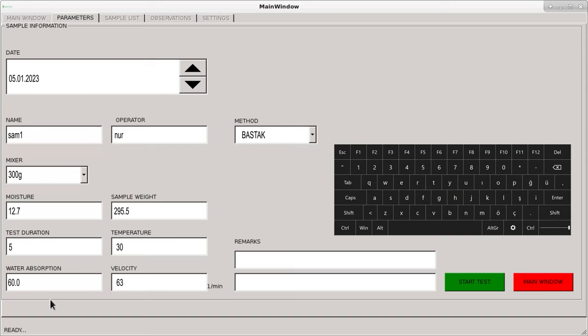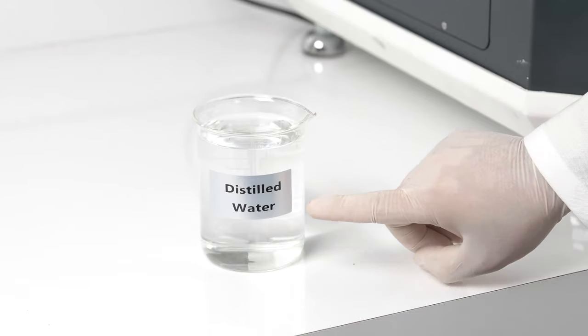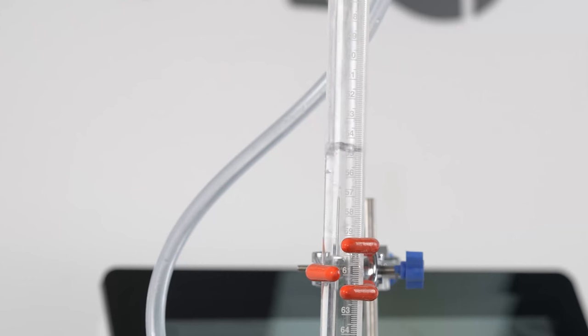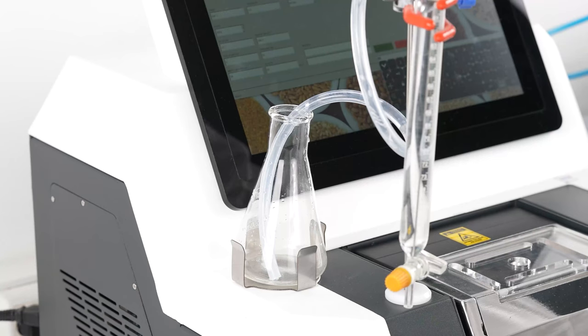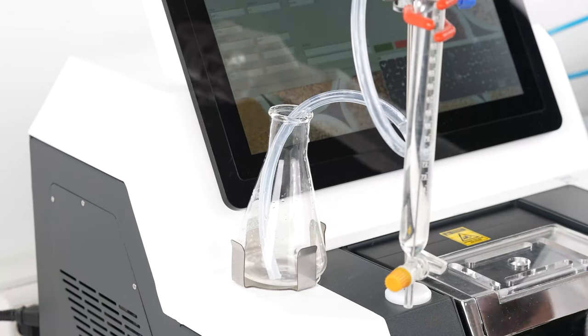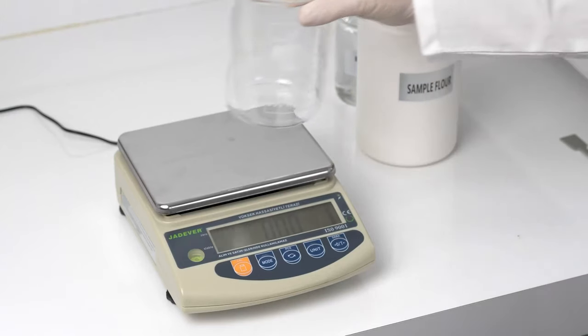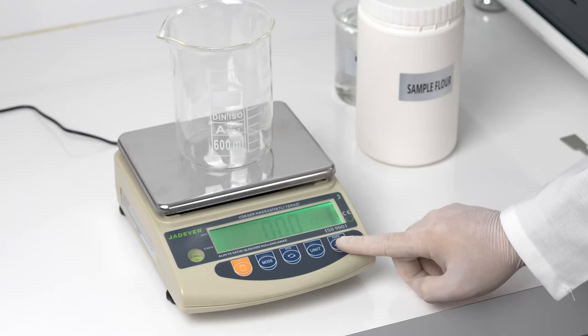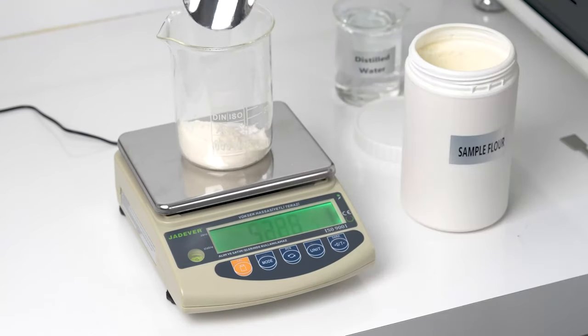The operating speed of the kneading blades, test temperature, and additional information can be monitored on the touch screen. Pure water at standard temperature is transferred to the glass burette, and excess pure water is automatically discharged. The flour sample is then weighed with a precision of 0.01 gram after a container is tared on a precision balance.